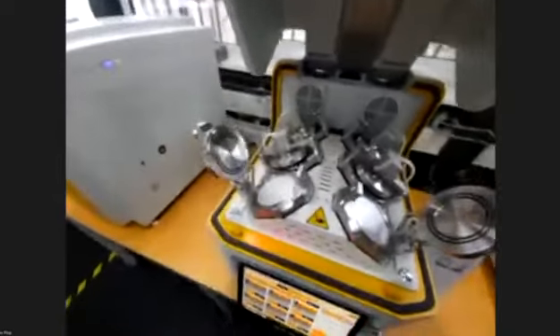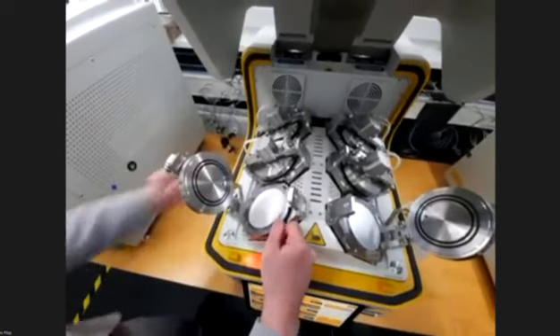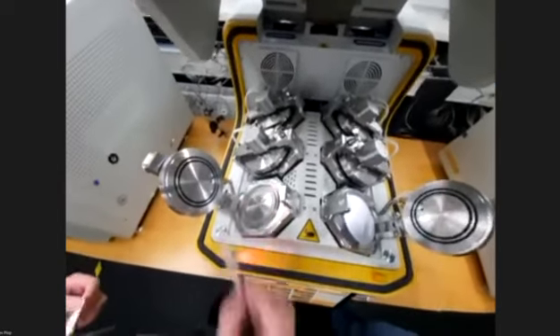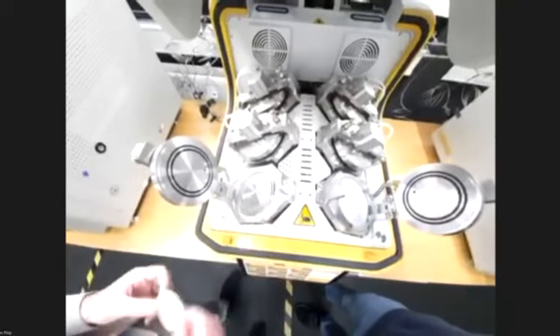Coming back to the tester, like I was showing, we prepare them, we can release them. To fix our samples, we need to apply vacuum grease in the testing area.